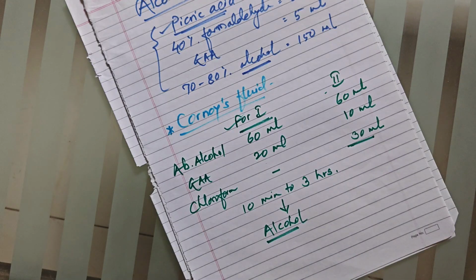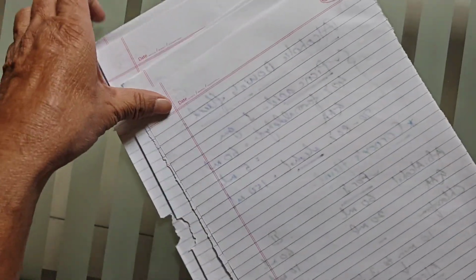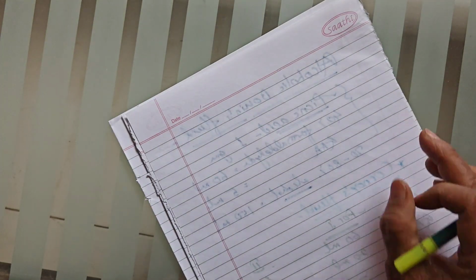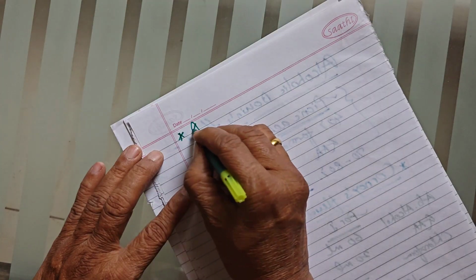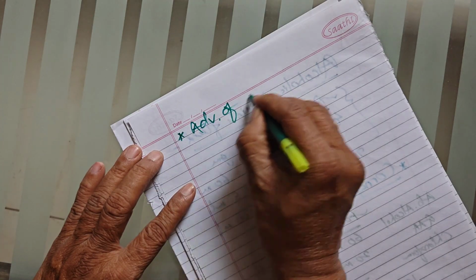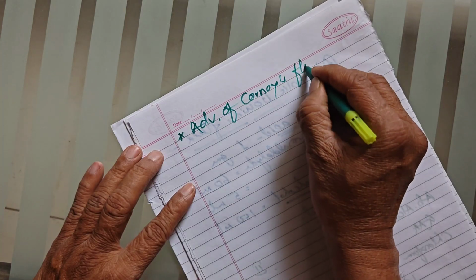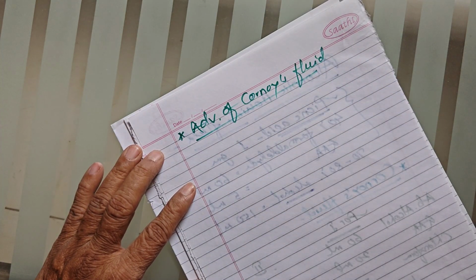So let us focus on the advantages of Carnoy's fluid. Okay, friends.